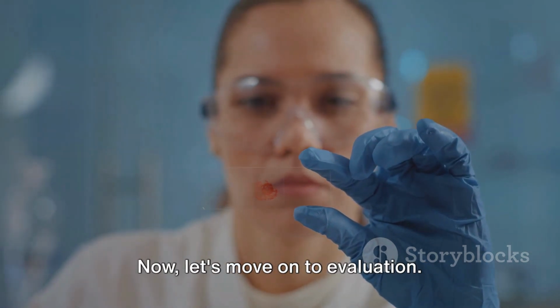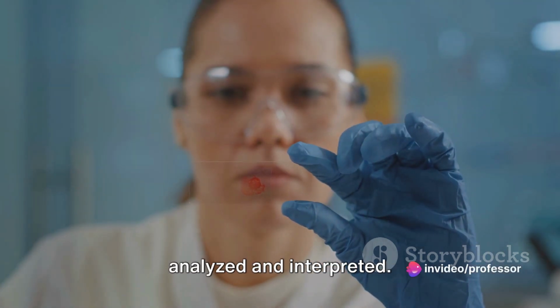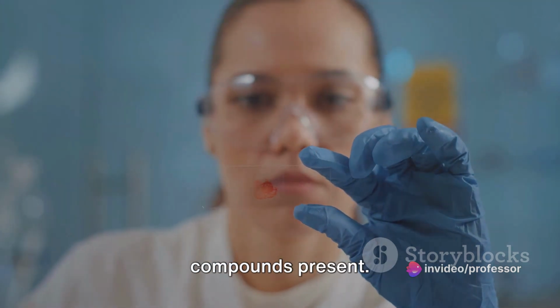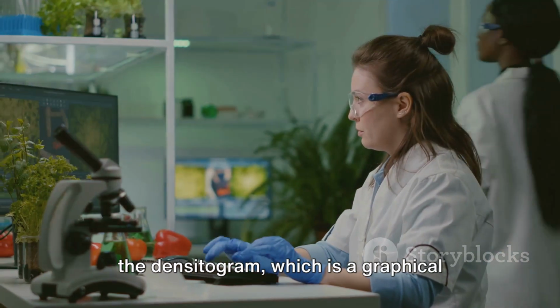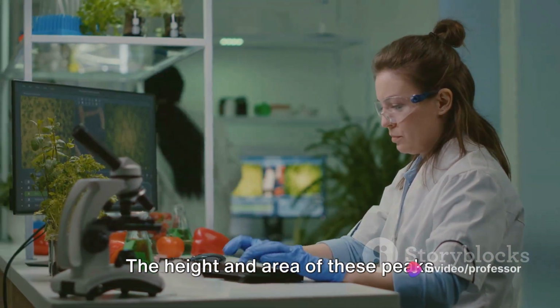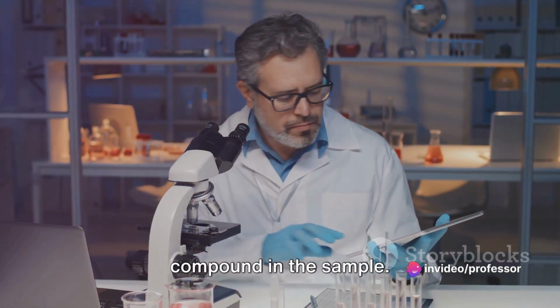Now, let's move on to evaluation. The data from the densitometer is analyzed and interpreted. The aim is to identify and quantify the compounds present. Each compound presents a unique peak on the densitogram, which is a graphical representation of the data. The height and area of these peaks correspond to the concentration of the compound in the sample.